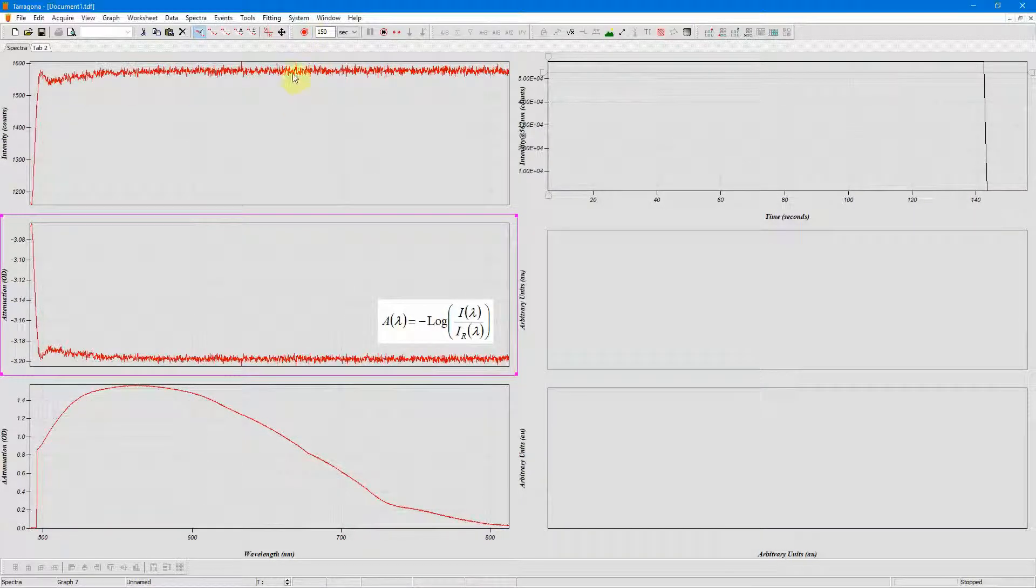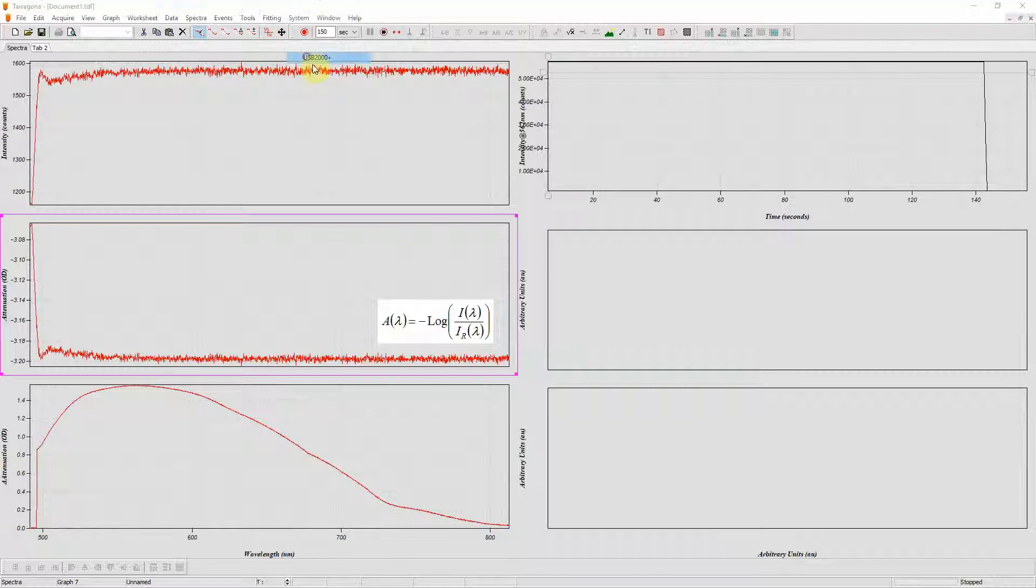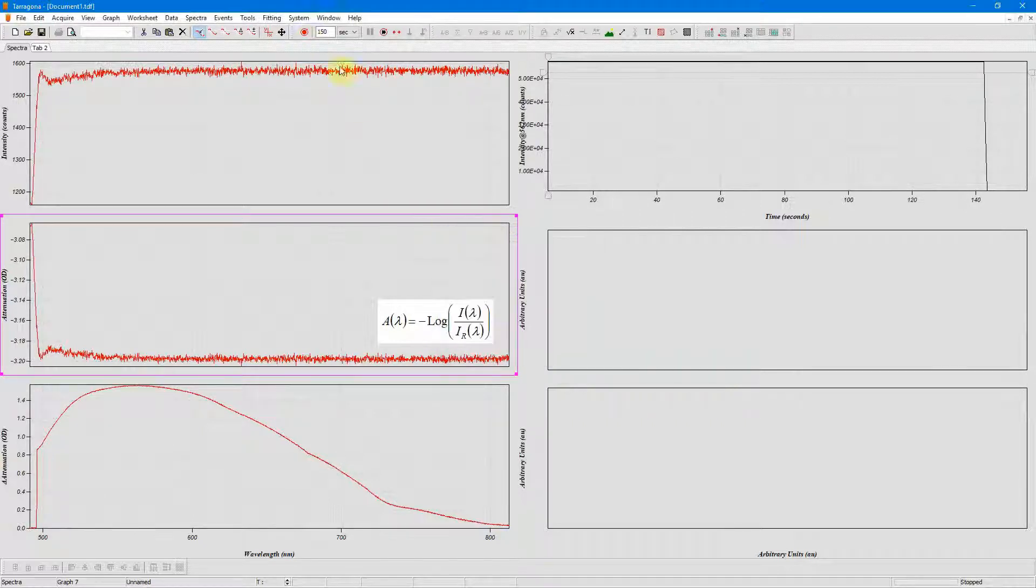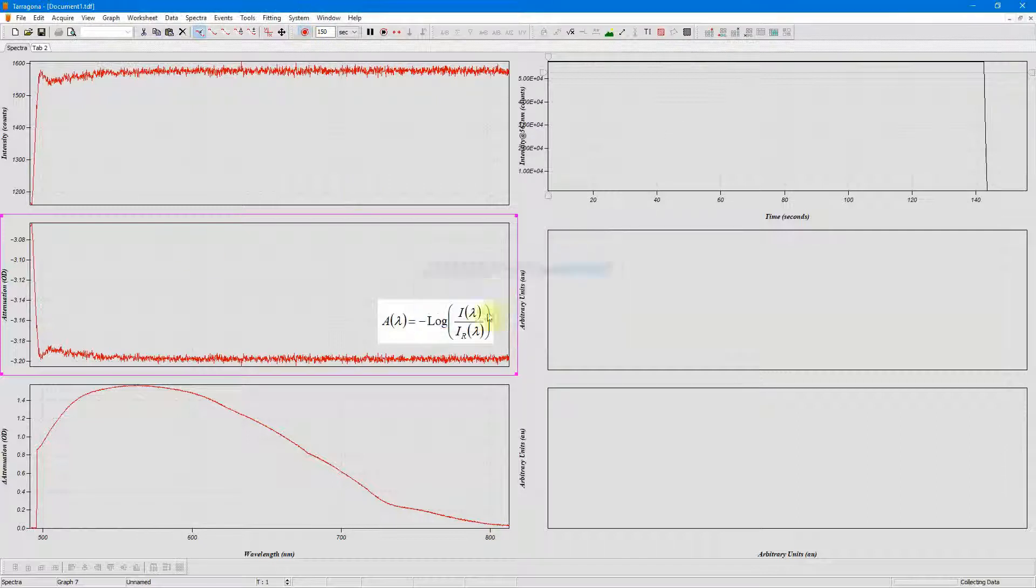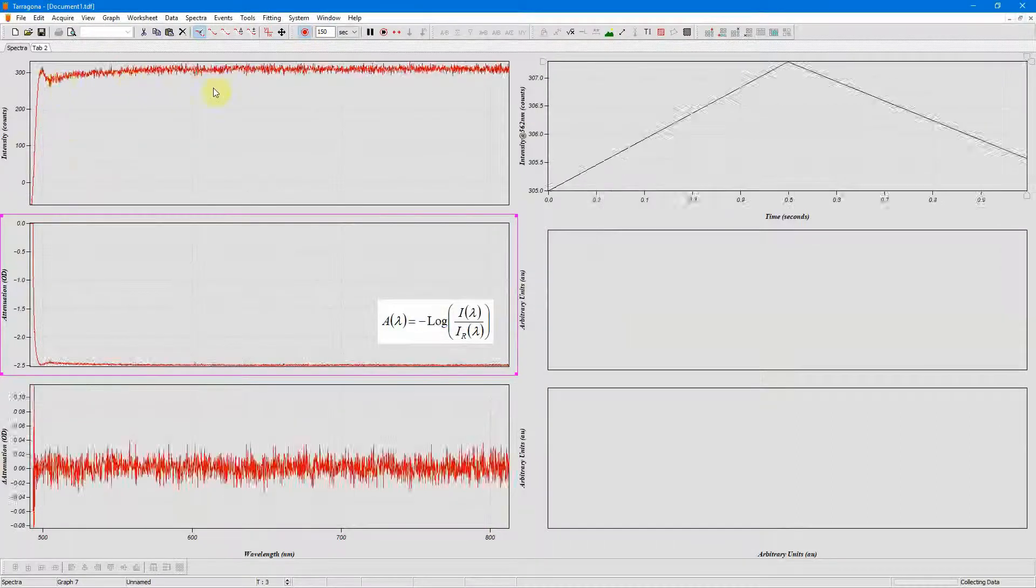So I can try and correct for this spectrum by doing the electrical dark correction. But even now when I click data you can see that my spectrum is still not flat and zero.